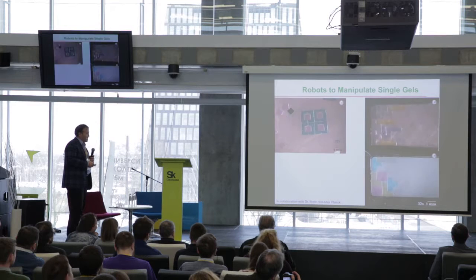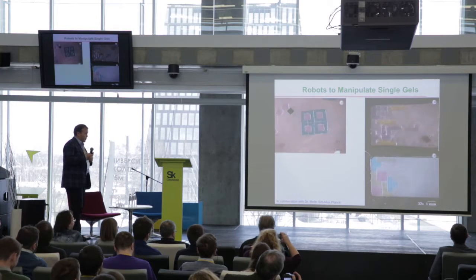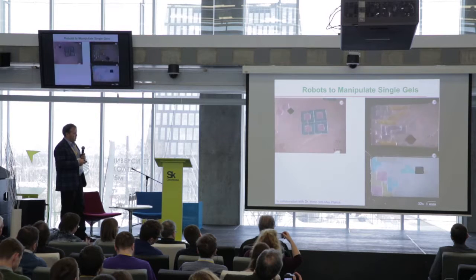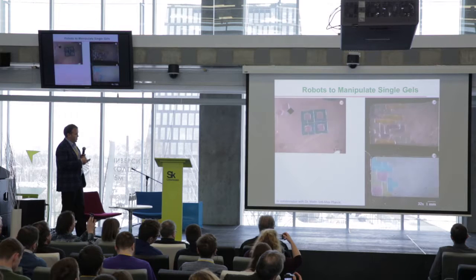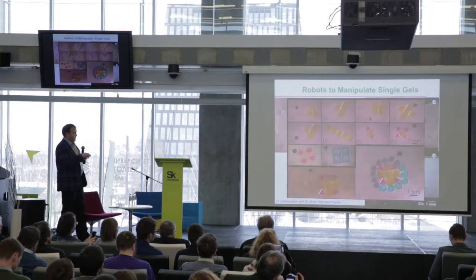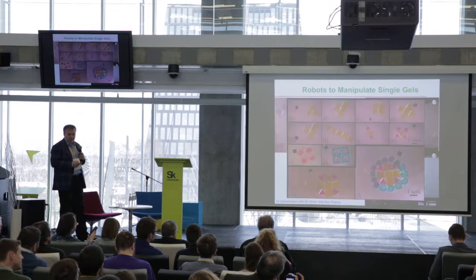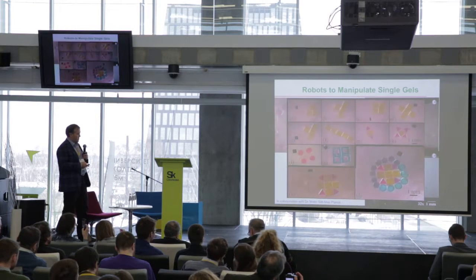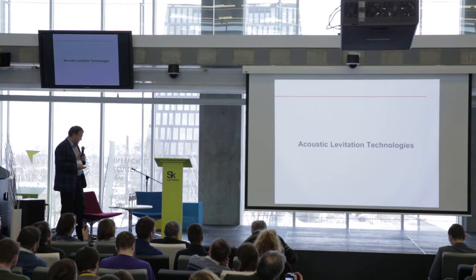That was a neat experiment showing controllable gels, but scalability and automation of this process could be interesting for maybe some in situ type applications, which could be explored in the future. You can pretty much control this like a joystick on your computer, or automate it by integrating image recognition algorithms. This is micro-robotics in action for building things.